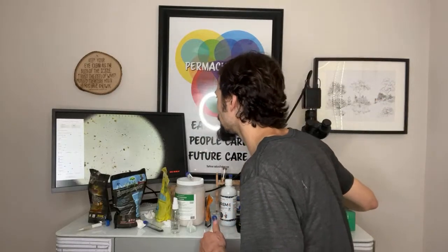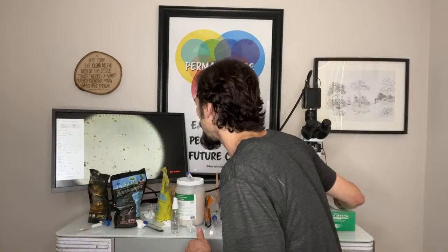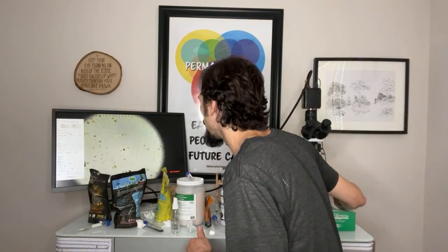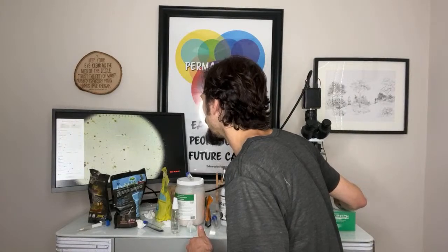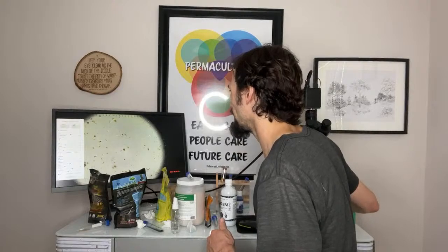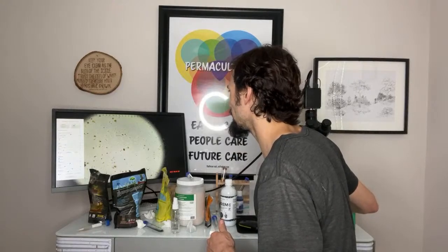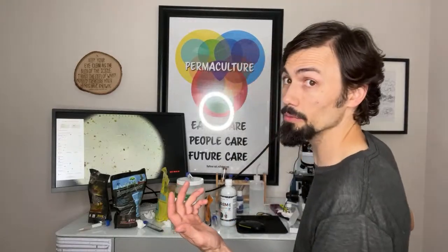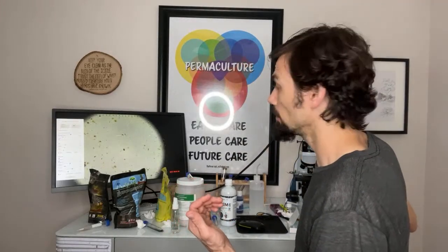So I see a lot of mineral, it's a pack of mineral. And it looks like there could be bacteria, but nothing's moving because we just added the water and there's no sugar. This is a good lesson. This is why Recharge does that, okay?